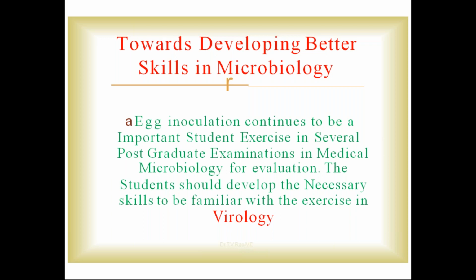Egg inoculation is important for the students, not only undergraduates, but also postgraduate students, for the evaluation of the replication of the viruses in the living cells. The students should develop the necessary skills to be familiar with the exercise in virology. It is an applied exercise question. We have to tell what type of viruses will grow. There are different viruses, DNA viruses, RNA viruses, etc. Sometimes some bacteria also will grow in the embryonated eggs.